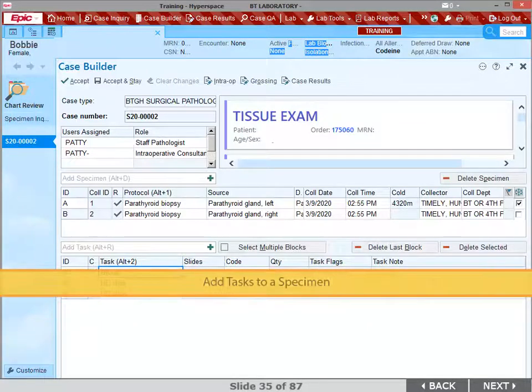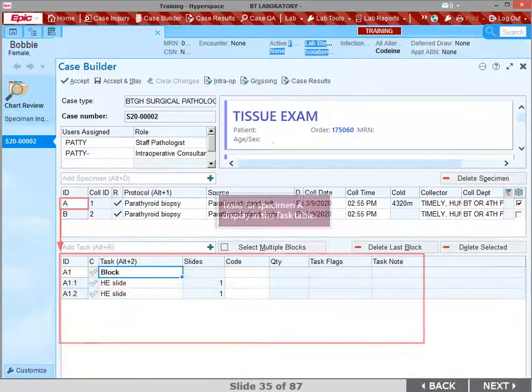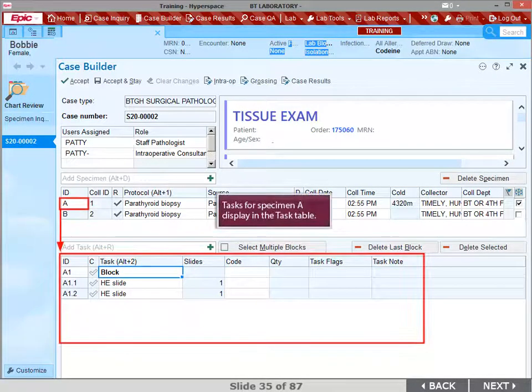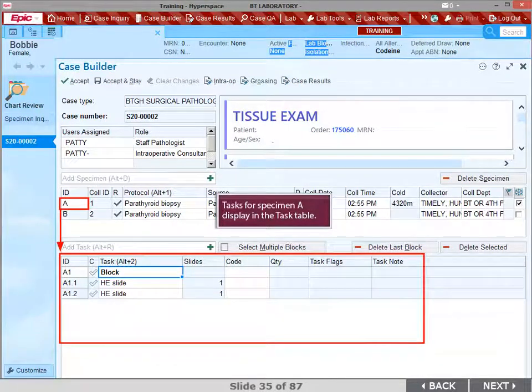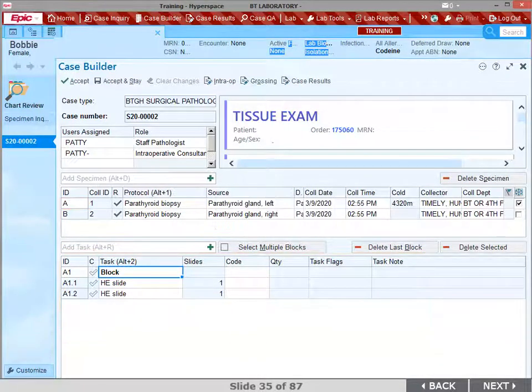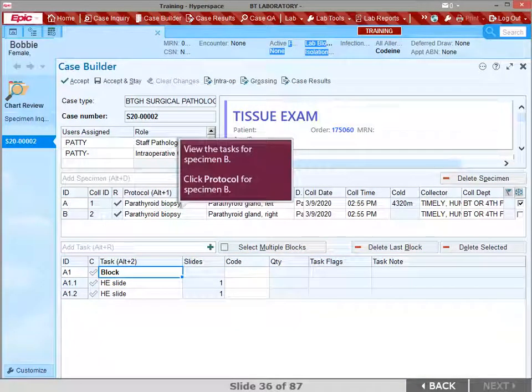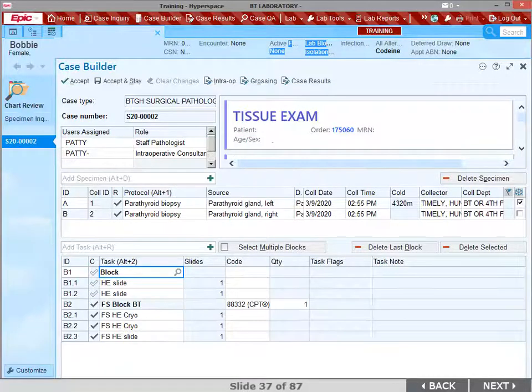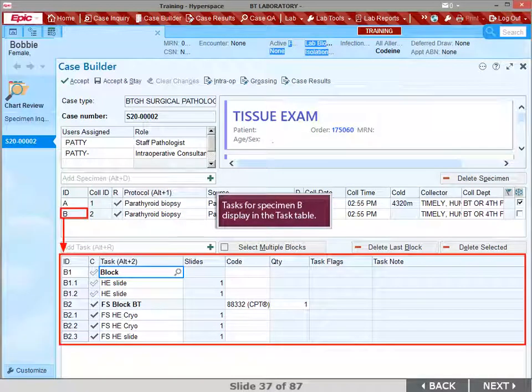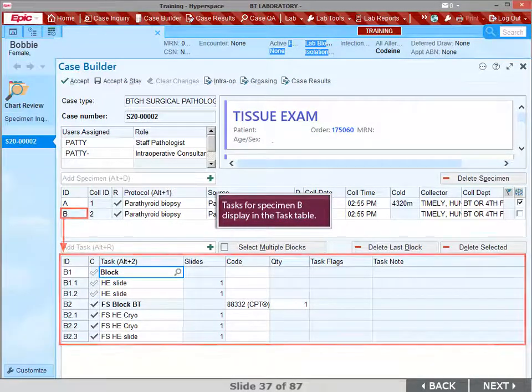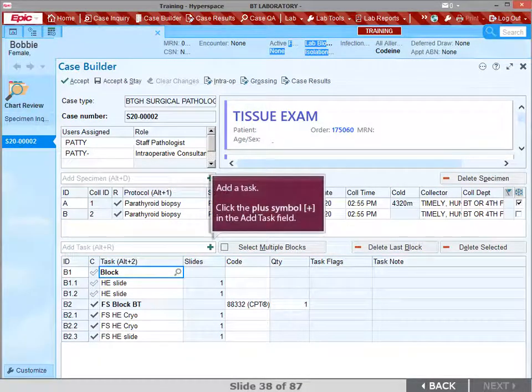Notice that tasks for each specimen automatically display in the task table. Right now we are viewing the tasks for specimen A. To view the tasks for specimen B, click the protocol for specimen B. Tasks for specimen B display in the task table. To add a task, click the plus symbol in the Add Task field.